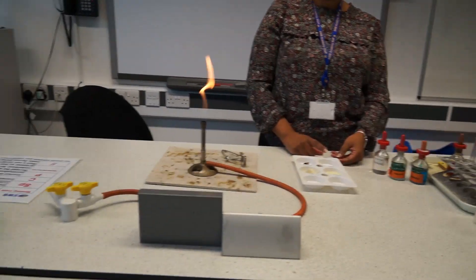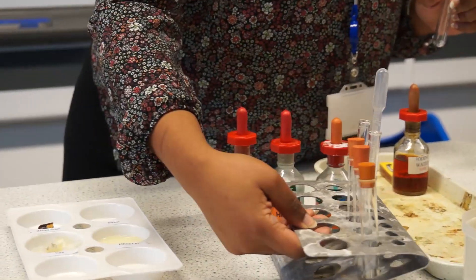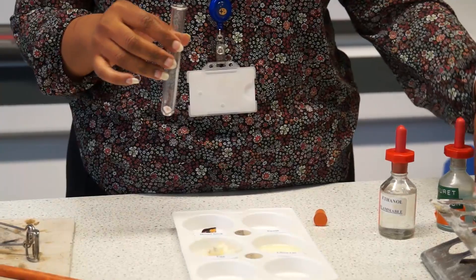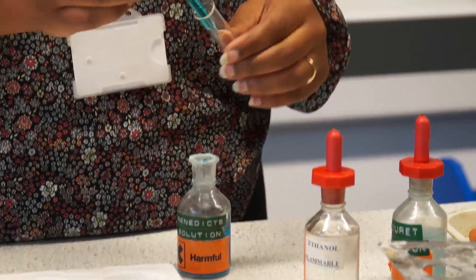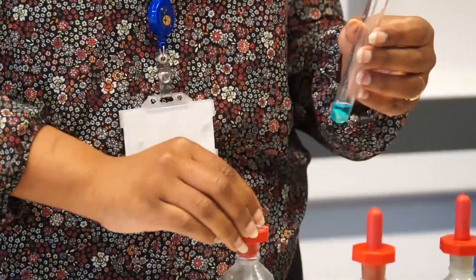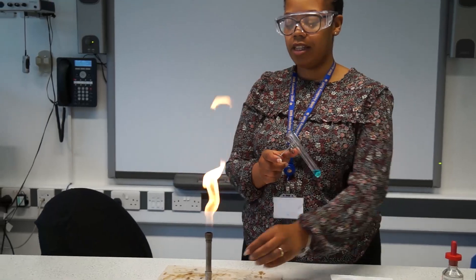The next one we're going to do is a test for sugars. We've got some sweets. We're going to use a test tube and place the sweets in that test tube. We're going to use Benedict's solution which is blue and add that to the test tube. We just want to cover the sweet.